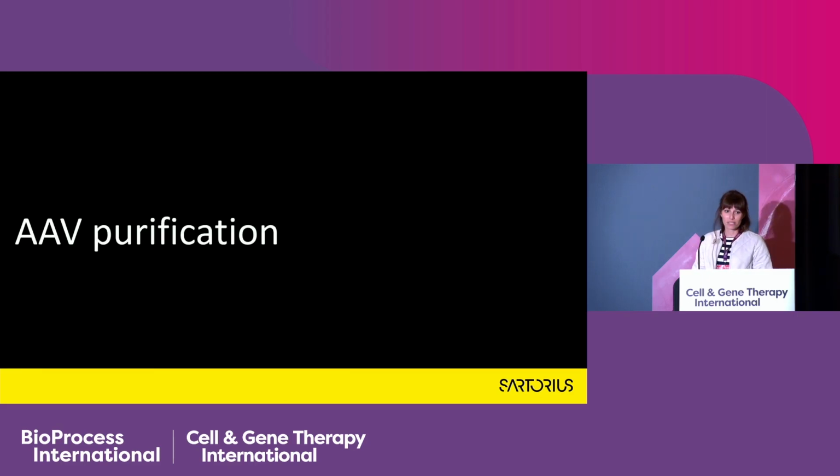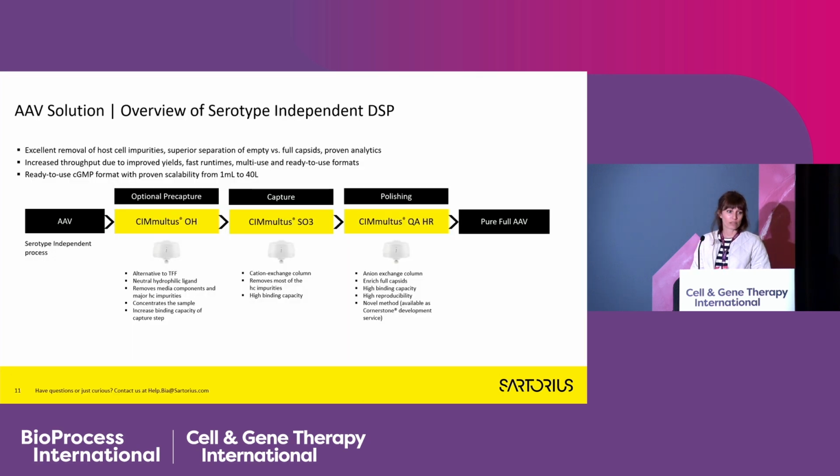So now let's dig into AAV purification. For those who were attending Daniel's lecture yesterday about AAV purification and cost reduction, you maybe saw the application of capture and polishing steps, so the application of CIM SO3 and QA-HR monoliths in those two steps.